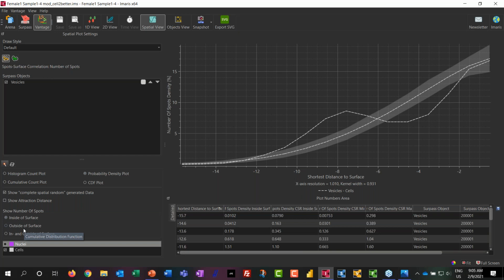Okay, thanks. And an important one, what about batch mode? Are all these analyses available in batch? Okay, so all of the computations are available within batch. Yes.